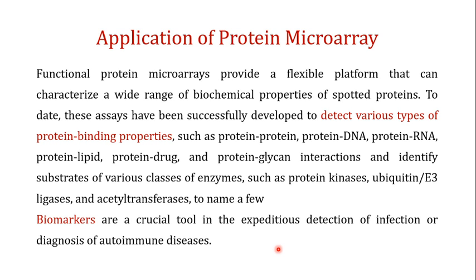Now, if you talk about the applications of the protein microarray, the functional protein microarray provides a very flexible platform that can characterize a wide range of the biochemical properties of the spotted proteins. As I've told you, these functional protein microarray assays have been successfully developed to detect various types of protein binding properties, for example the protein-DNA, protein-RNA, protein-lipid, protein-drug, and protein-glycan interactions.